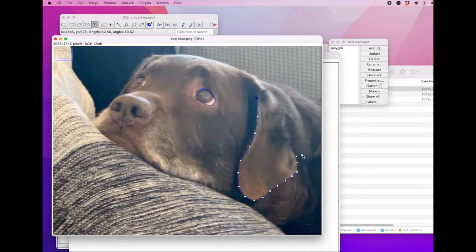All right, and so here I could draw another line. Since I know I want to stop here, I'll just double click on this last box. Oops, I'll double click again. There you go, and it ended. See that? So this is an open line segment tool, so it does not automatically close the shape for you. You see that? It leaves this open right here.